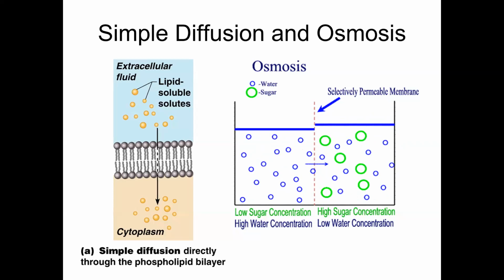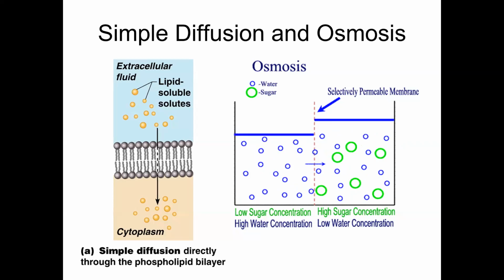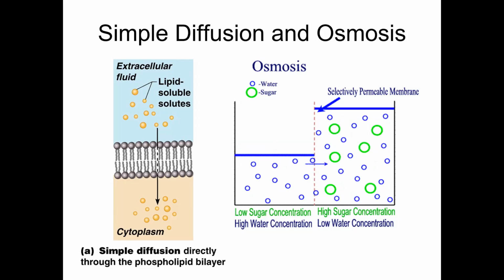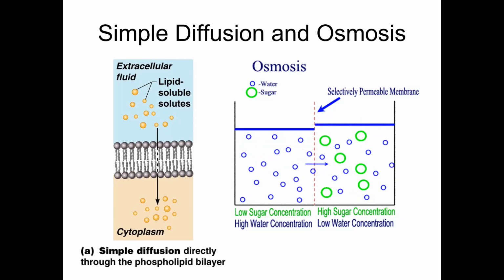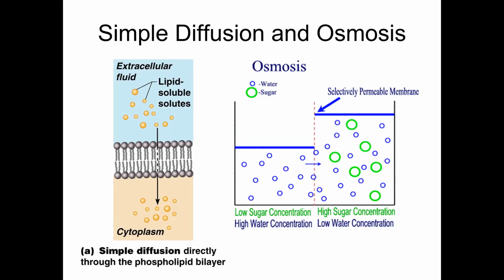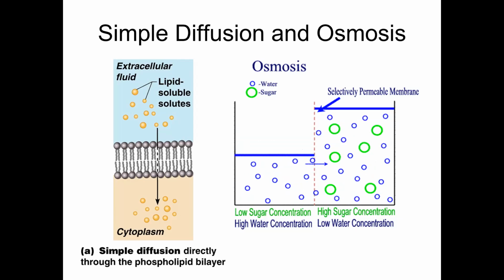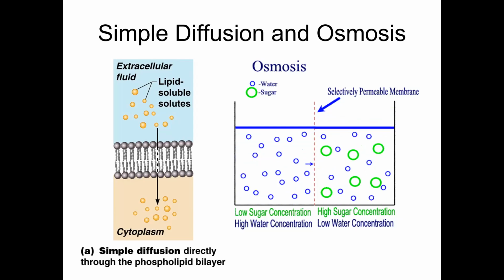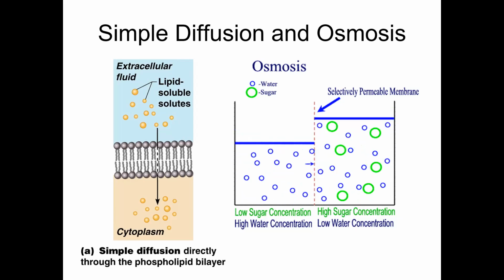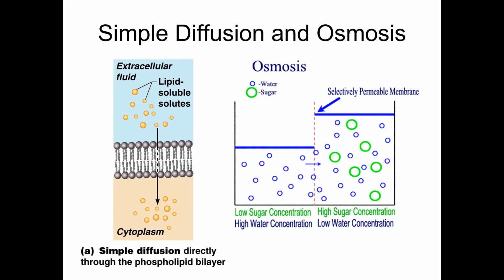This is what it looks like. Extremely thin. I've got 35 feet of this, and anything that's under 3,500 molecular weight will pass through here. Anything bigger than that will get stuck. So things like glucose and salt and water will pass through there, but other molecules larger than that won't.